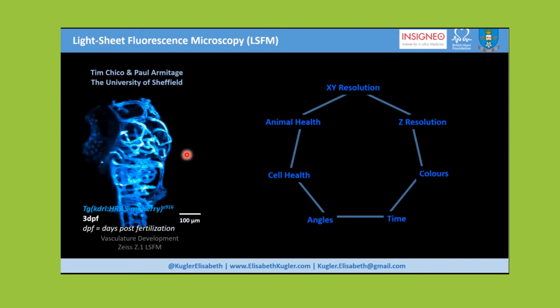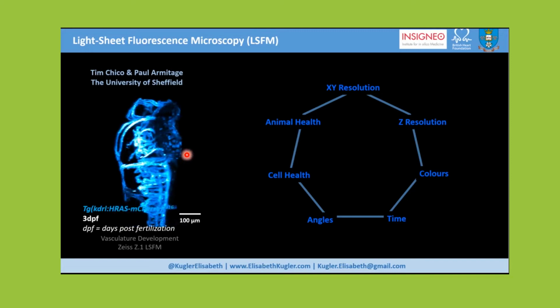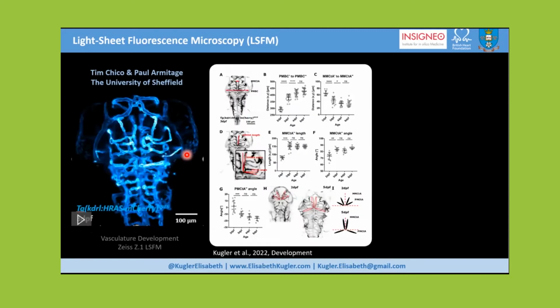And so we started off with, again, some data exploration, which was done manually. One thing is, for example, measuring the brain width and seeing how this is variable within age groups and how this changes, for example, over time. What we did is measure from this left vessel to this right vessel, the same one as shown here, which is basically surrounding the brain. And so we can use this as an approximation of the width of the brain.